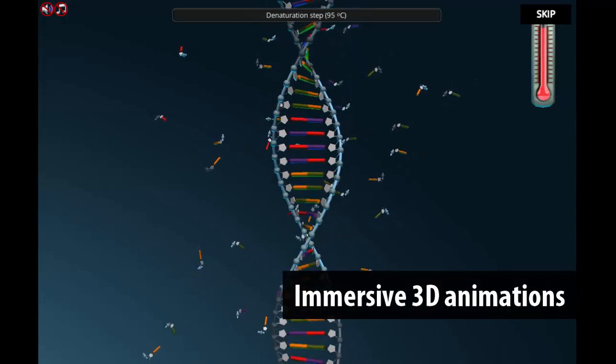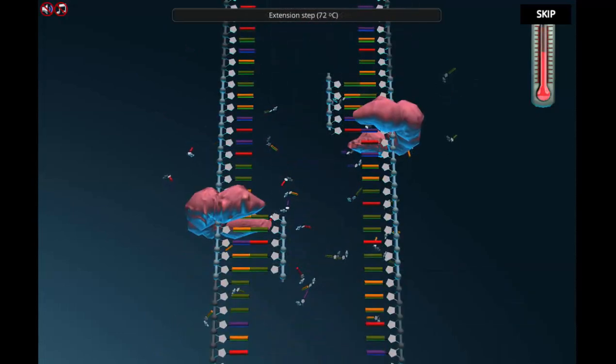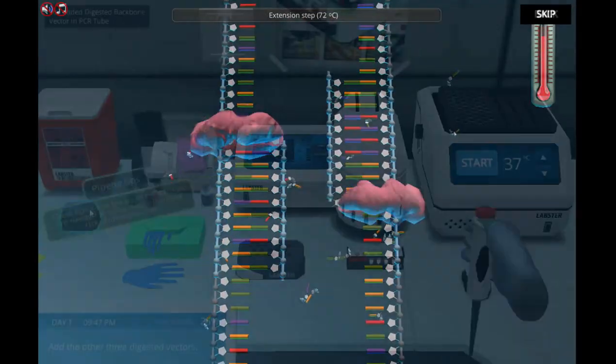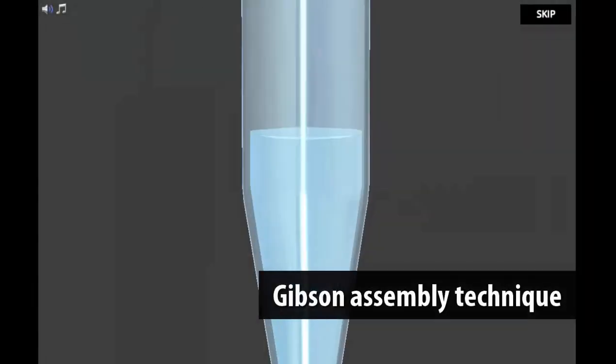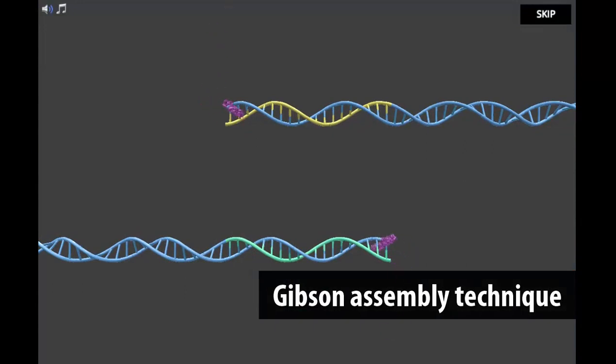Supplementary 3D animation illustrates what happens on the molecular level. After purifying the DNA fragments with magnetic beads, they will clone the plasmid vector with the Gibson assembly technique.